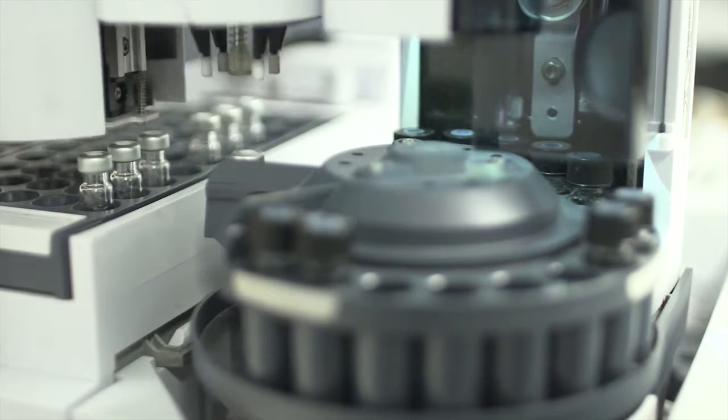Our measurement activities across several labs in Australia include a range of mass spectrometry on equipment from Agilent, Waters, Thermo Scientific and Shimadzu.